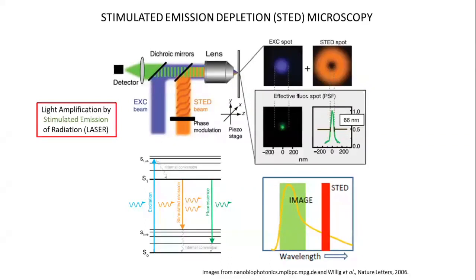you can have that light going past that excited molecule. The molecule basically senses there's an electromagnetic disturbance in its vicinity, and that stimulates it to radiate. It radiates exactly at the same wavelength as the stimulating beam and exactly in phase. So you get an excited molecule, one stimulating beam photon going past, and you get 2 photons coming out, and they're matched. The wavelength is the same, and that's important, which we'll see in a moment. But that molecule is now back down in the ground state. It's been switched off. So this is the switching off process, stimulated emission. And that goes on in the donut.